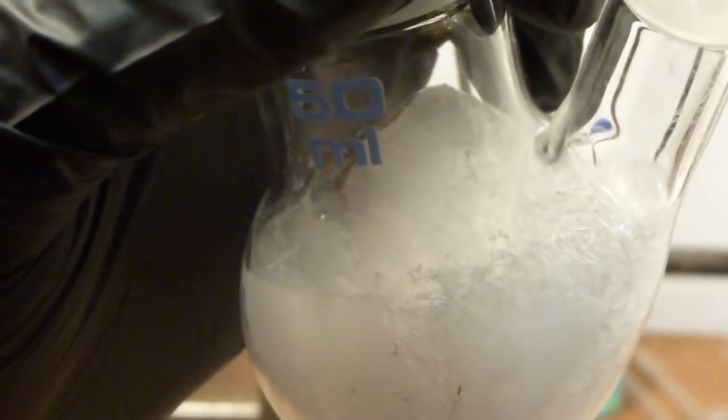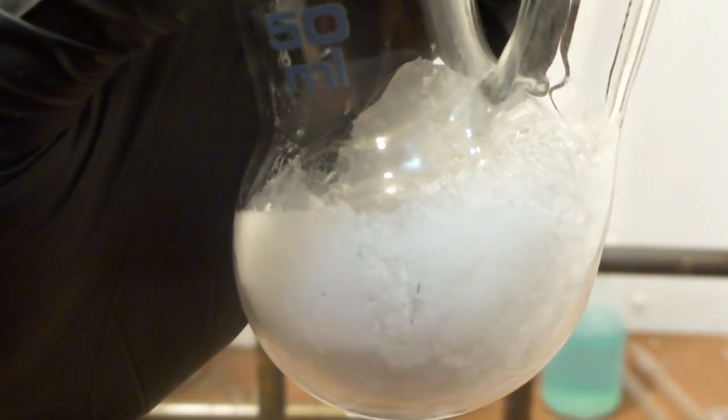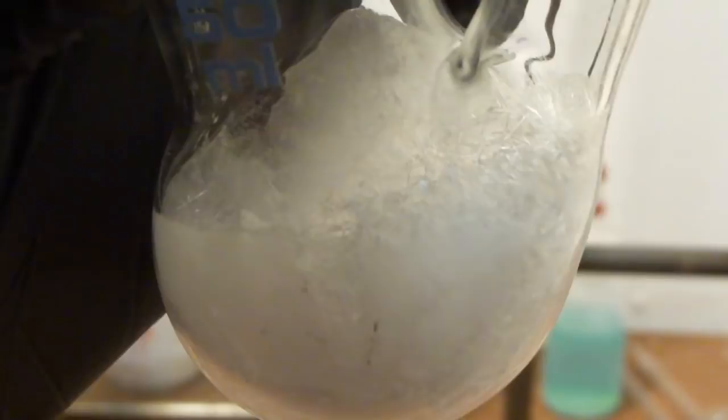So here's our final yield of trioxane in the form of beautiful long needles. The distillation process seems to work very well, and the only thing you have to do is to babysit it a little bit, so this is not the typical distillation that you can just run on autopilot. So you just have to sit there and occasionally knock it down with the heat gun. But apart from that, the process seems to work very well. And as you can see, we have obtained a perfectly pure trioxane.